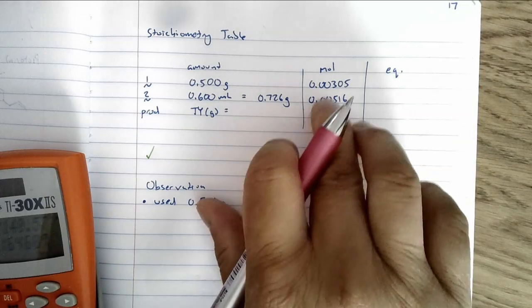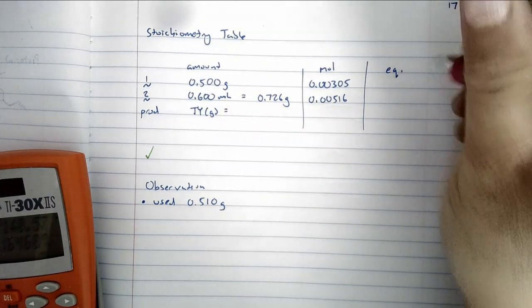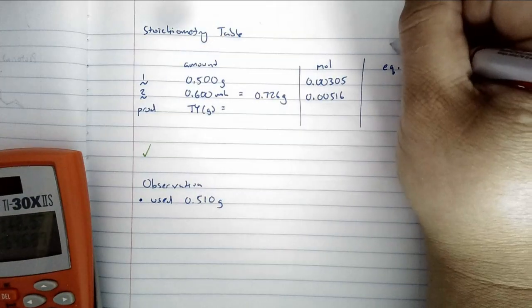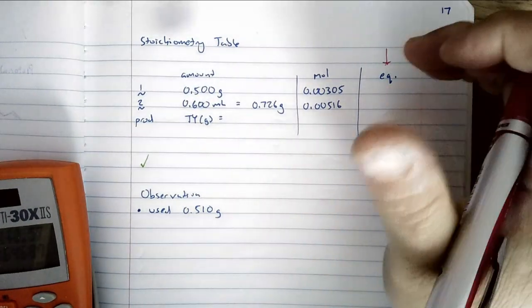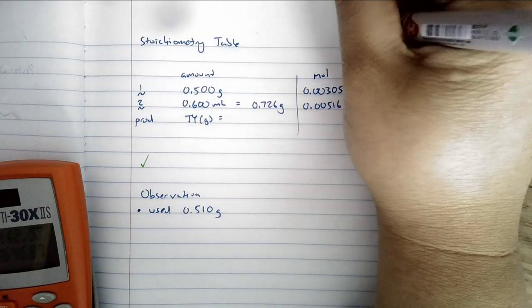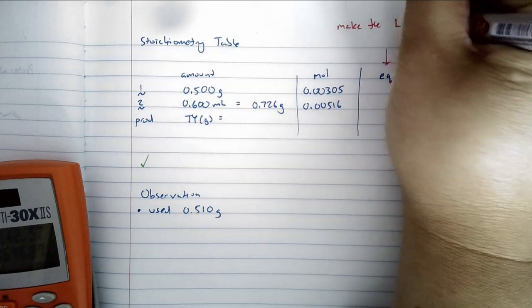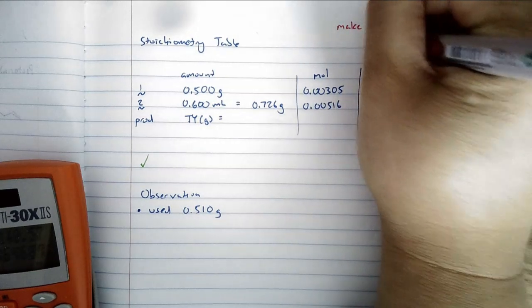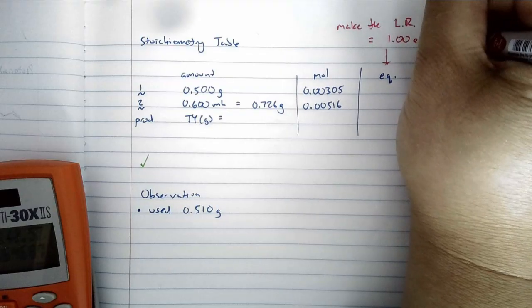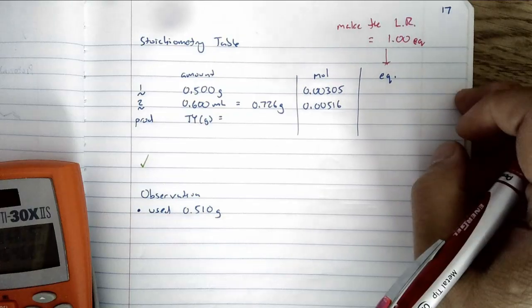So I don't know the limiting reagent yet, but I'm going to put a little note here for myself. Obviously you're not going to do this. This is just taking notes so you know how to do this. Make the limiting reagent equal to 1.00 equivalents. And then based on that, figure out what the other equivalence is.